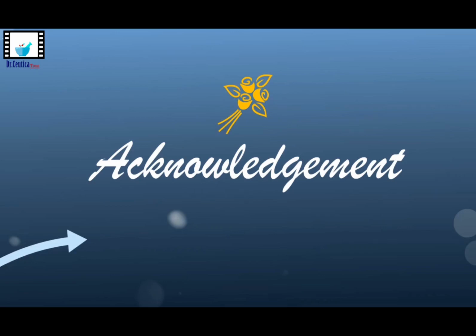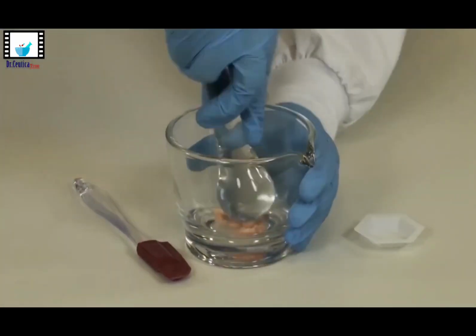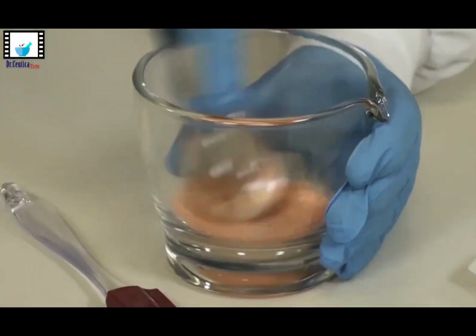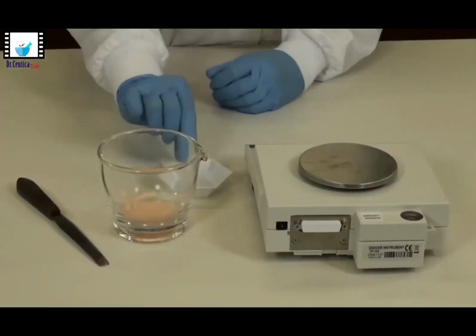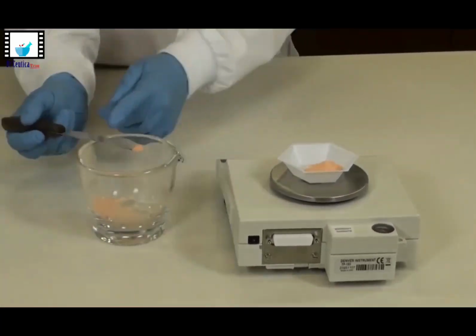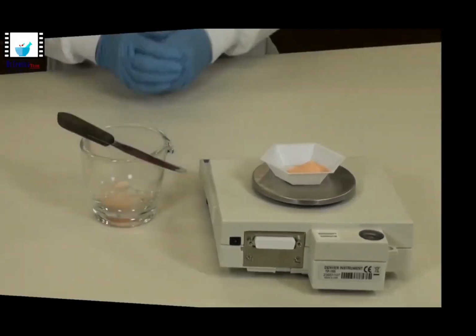The following procedure is to prepare allopurinol hydrochlorothiazide suspension. As we said, we start by weighing the solid ingredients. First, the allopurinol is weighed from crushed tablets powder. Then the required number of the hydrochlorothiazide capsules are emptied. Both powders are mixed geometrically.